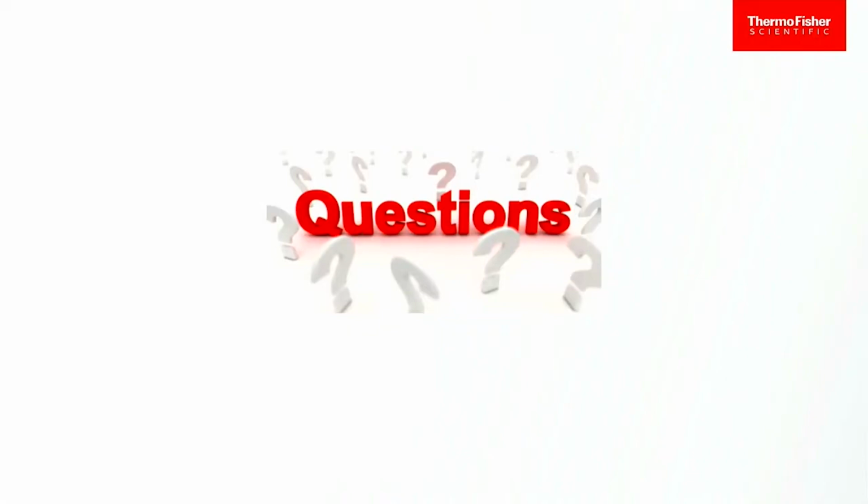That's a deep question. They both work. We have optimized our RT reactions to work in different ways. So what we're actually using in which tube, we'll have to dig into. So, again, what are you doing? We have to ask questions before we can answer them.